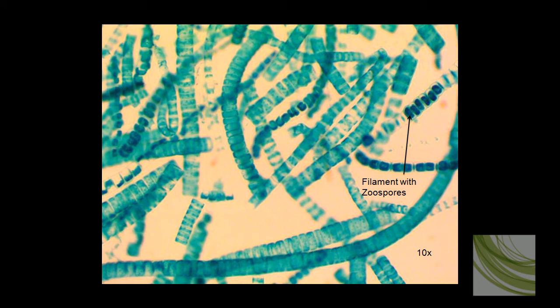Now here we have zoomed in to get a closer look at this specimen, and we're using the 10x objective. The zoospores in these segments are much more apparent, and then we have empty segments with just chloroplasts in them.